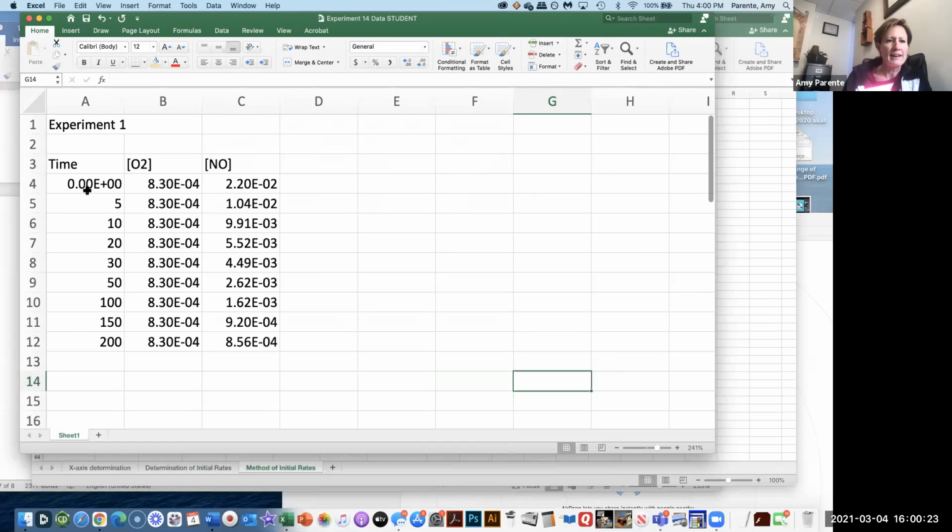So what we've got here, and remember I said that Excel likes to see things where we have our X data first, and then we're going to have our Y data. Look at this, it is holding this guy constant. So we're not going to be plotting here. We're actually going to be plotting time as a function of NO. So we need to plot this 3 different ways.